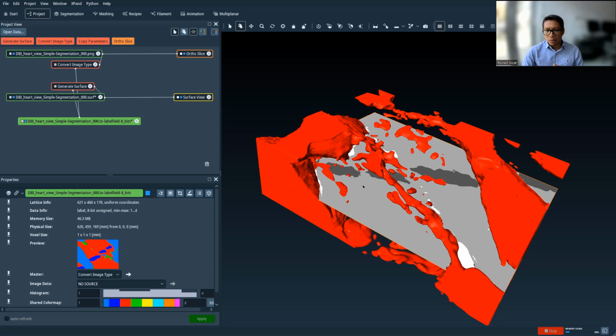So it looks like there are no questions. Again, if you have questions, just post them in the chat. And yeah, I'll go ahead and play the video for the next part, which is 3D reconstruction.